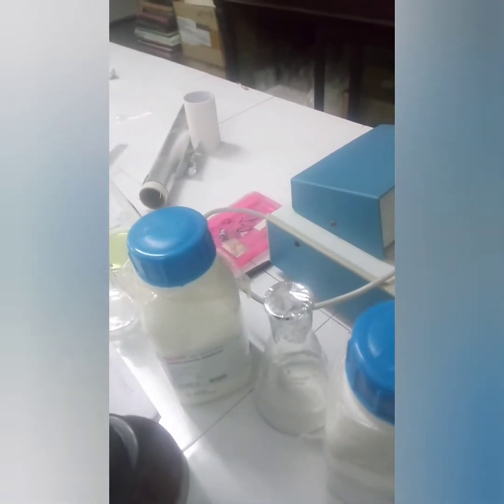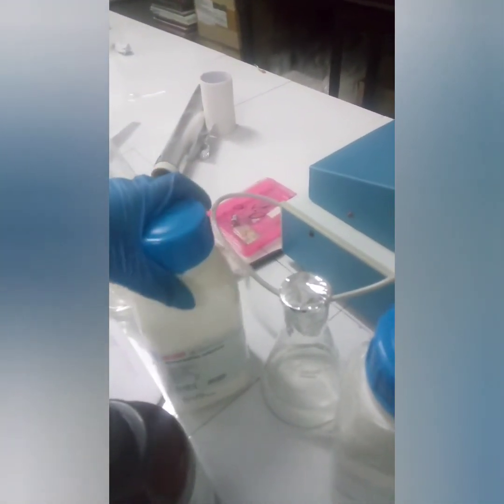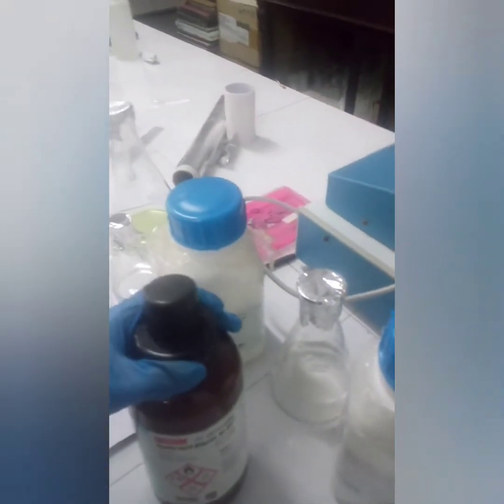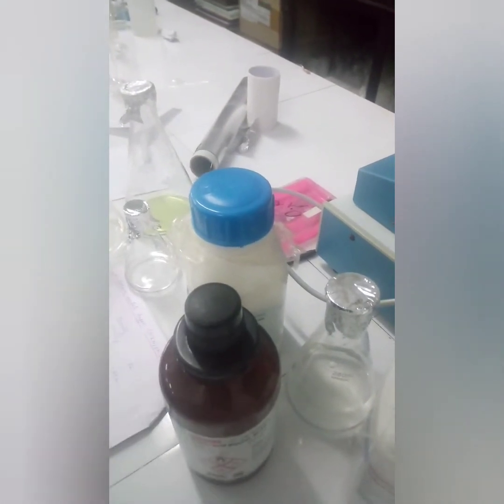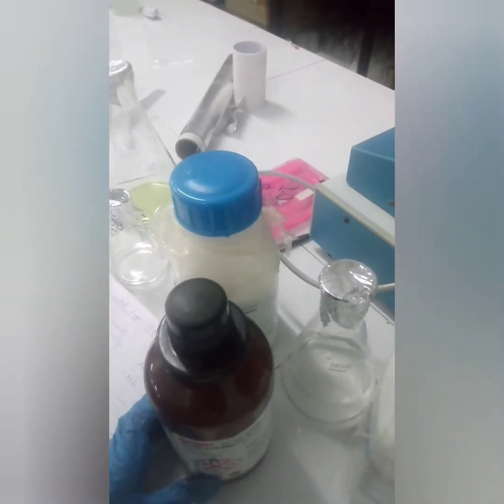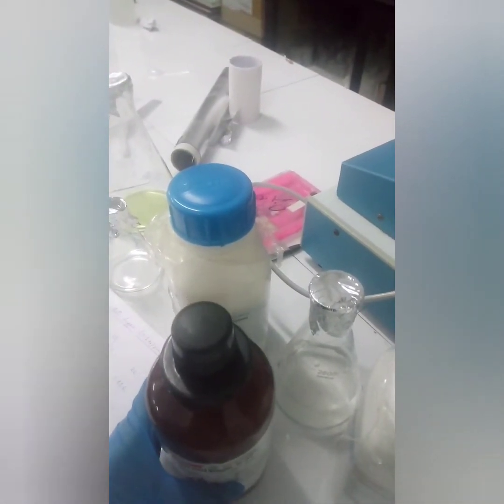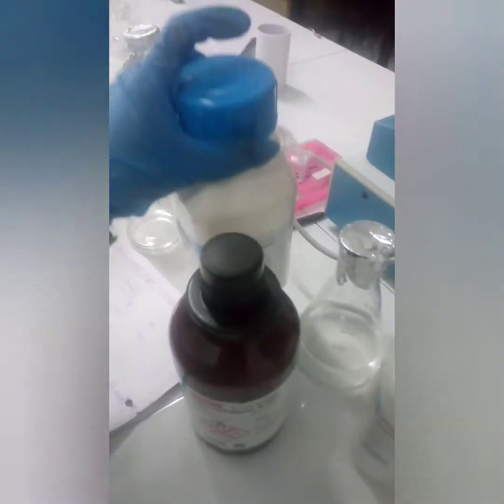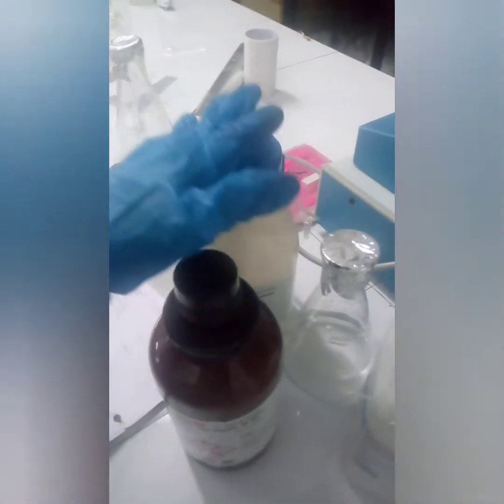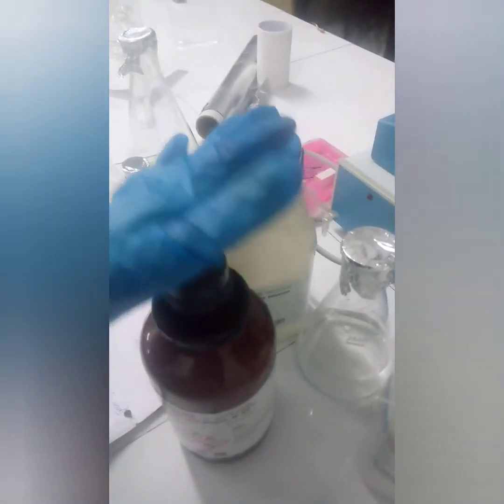In order to prepare the buffer, we require sodium acetate and glacial acetic acid, and we will mix these together. We prepare 12 ml of glacial acetic acid and 54.43 gram of sodium acetate in 2 liter of water. After mixing these two, we need to measure the pH of this buffer, which should be at pH 5.